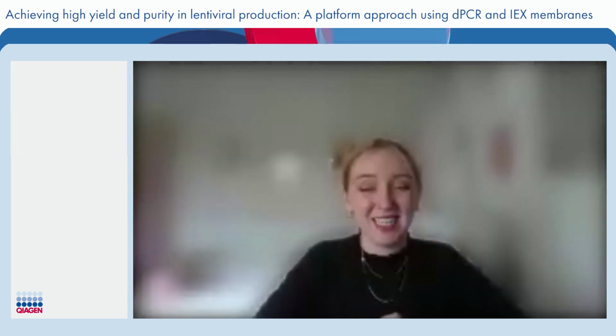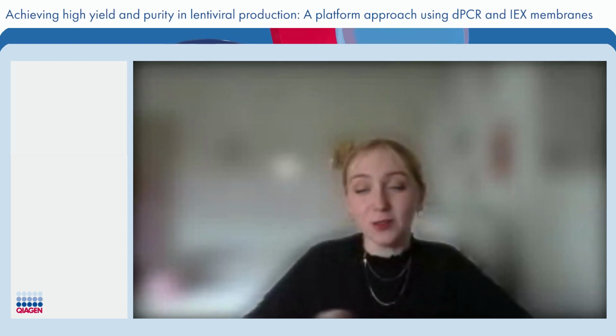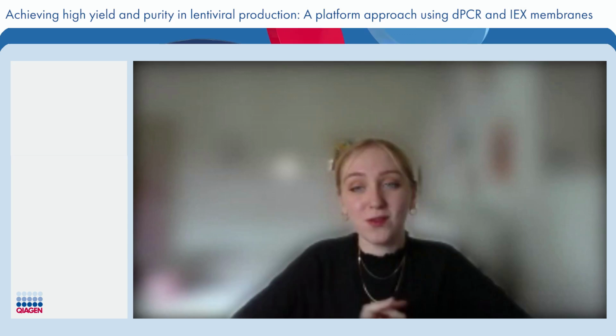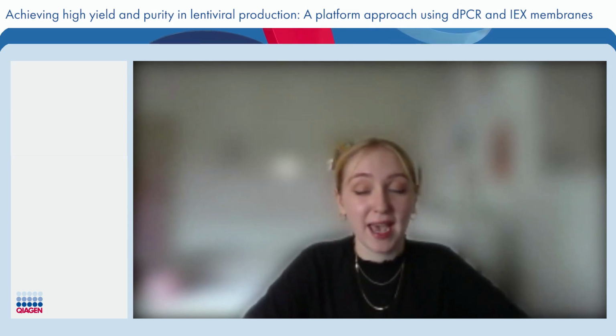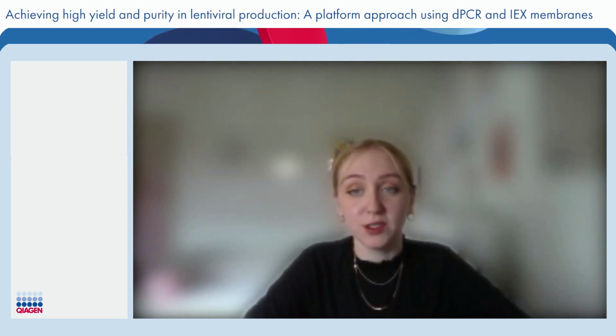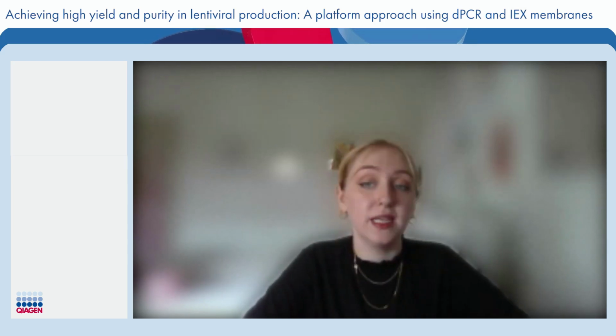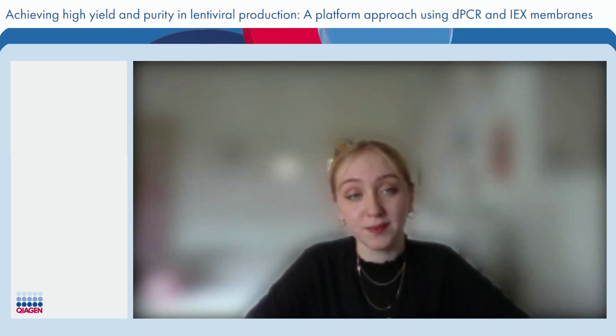Thank you, Jay and Oksana, for a great presentation there. So we'll now start our Q&A session, so please do keep your questions coming in. Our first question here is for Jay: what specific limitations of resin chromatography beyond processing time and material costs led you to explore the membrane absorbers?